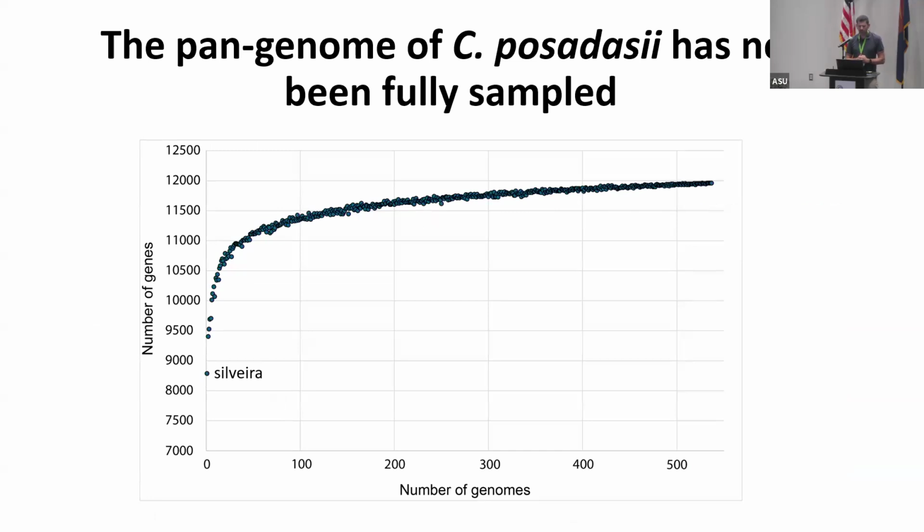When we plot the number of genomes versus the number of available genes, what we can see is if we sequence very few genomes, we don't have as many genes to look at, but the more genomes that we sequence, this profile goes up, and it's nearing a flattening. But again, these are just genomes sequenced here in Arizona. So as we expand that out to the global set, we expect this number to go up. But this is a large sample space to start investigating and answering some questions about genotype-phenotype relationships.